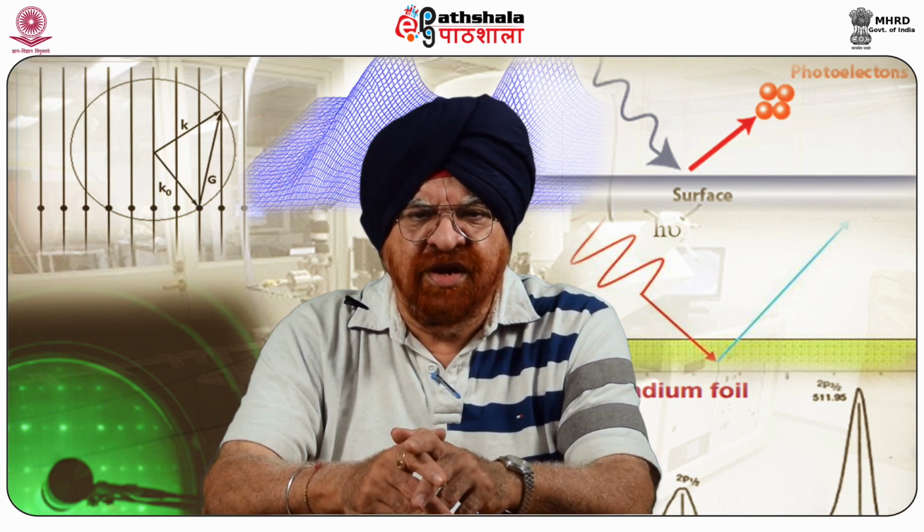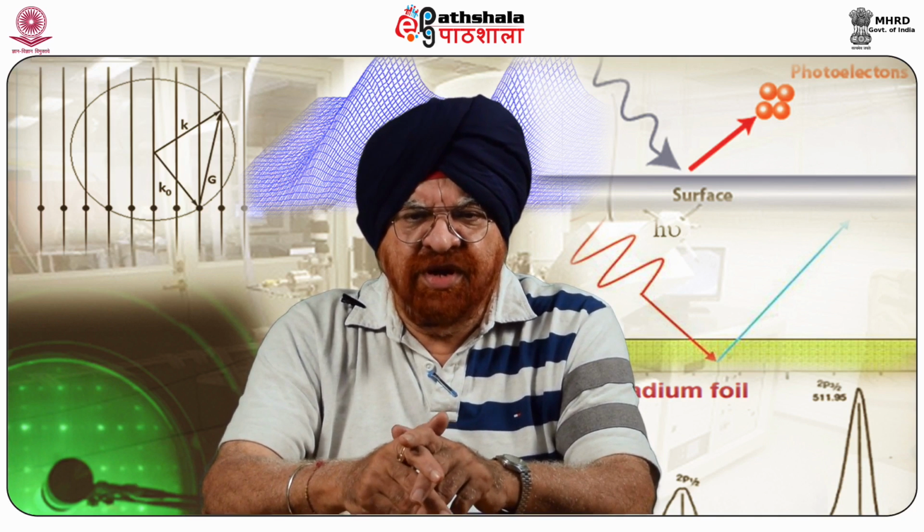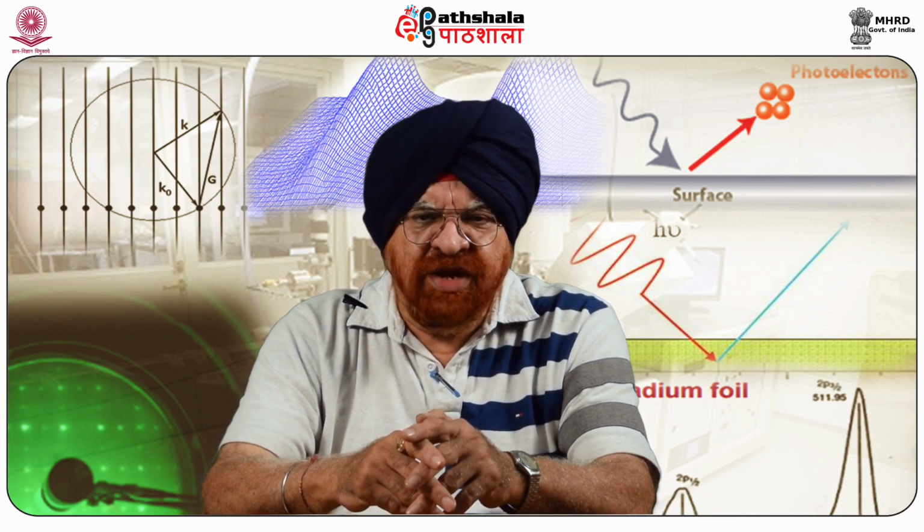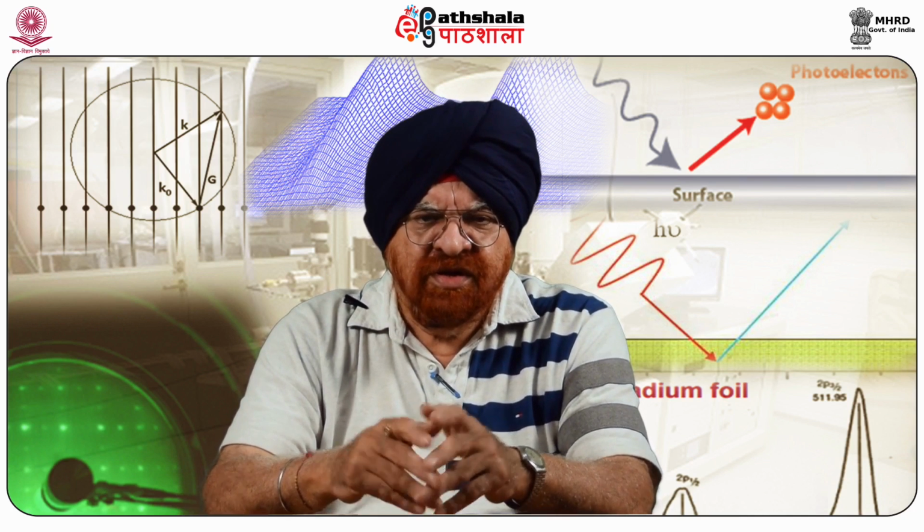Then we come down to the historical background. In 1887, Heinrich Rudolf Hertz discovered but could not explain the photoelectric effect, which was later explained in 1905 by Albert Einstein. In 1907, P.D. Innes experimented with the Roentgen tube, Helmholtz coils, and a magnetic field hemisphere.